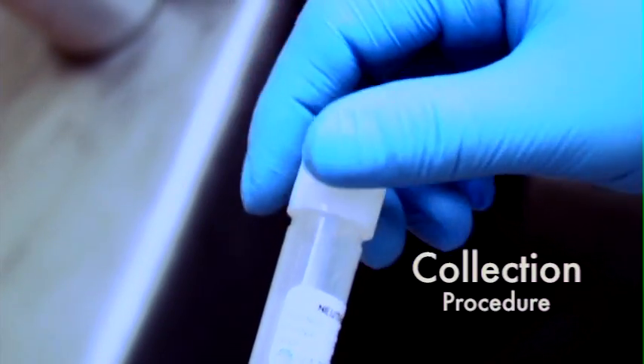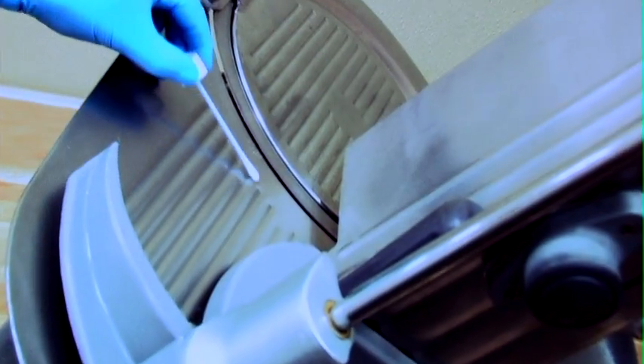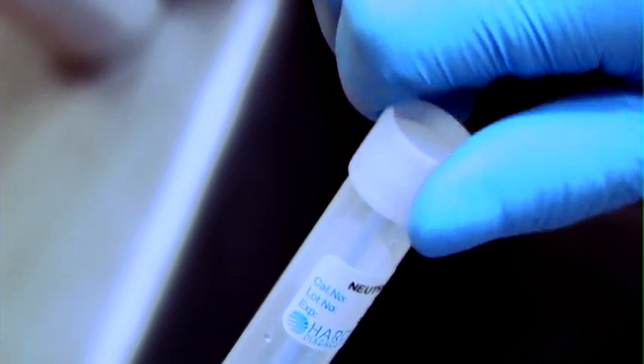Unscrew the cap and remove the swab from the tube. Aseptically collect a sample by rubbing the swab over the sample area. Reverse direction between strokes. Repeat the collection procedure three more times, returning the swab head to the EnviroTrans media after swabbing each area.